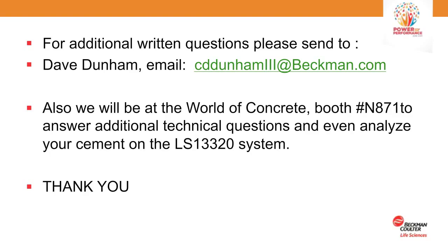As I mentioned during the lecture, the universal liquid module has a built-in pump, so it's drawing fluid from a source. This can be a 5-gallon container or a gallon bottle sitting next to the instrument, or underneath the instrument if it's a 5-gallon container. It can draw it up from the floor. So it has a very good diaphragm type pump to pull clean fluid up for rinsing purposes.